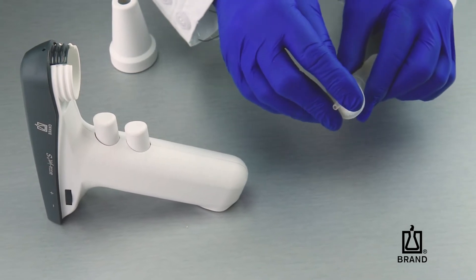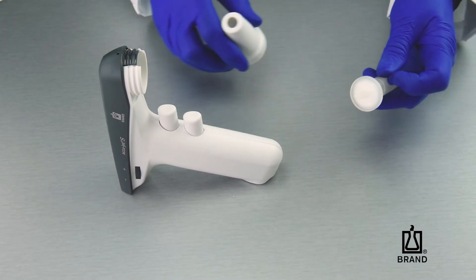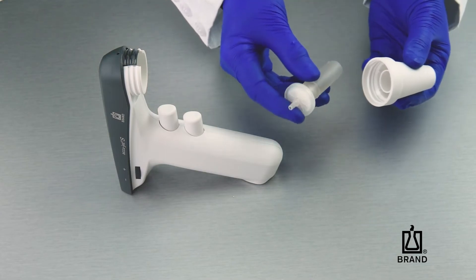The AccuJet S comes with a 0.2 micron filter installed for cell culture work. A 3 micron filter is also available.